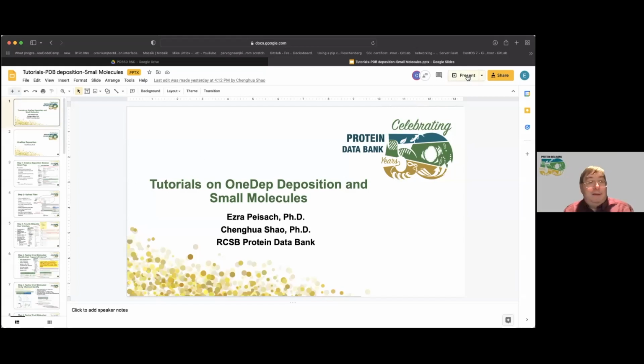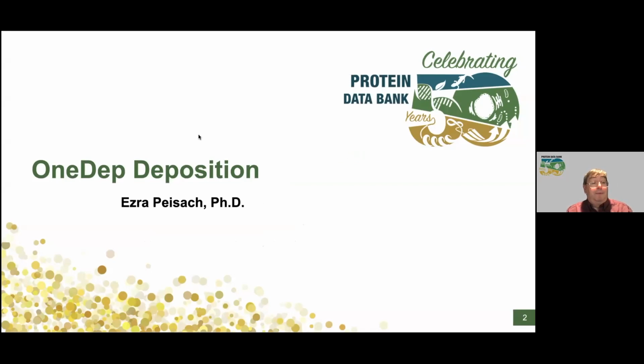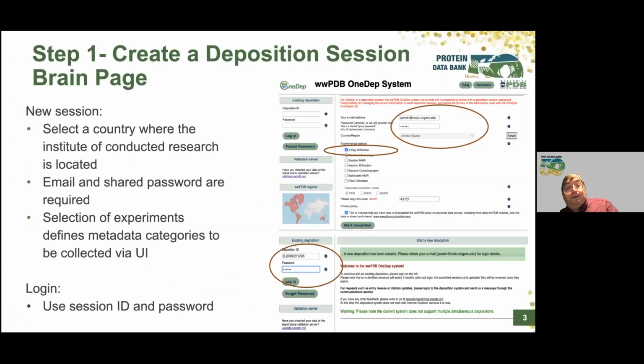Okay, thank you, Stephen. Everyone hear me? Okay, good. So Chenghua and I are going to discuss two quick little tutorials on the OneDep deposition in small molecules, searching within various resources. For mine, we do not have a sample server that you could just play with, but you could use our validation server for some of this process to see what type of things would come out with reports. So the first thing is you want to start a deposition.